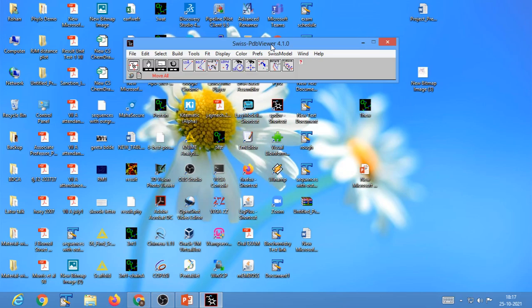Okay, so sometimes it might happen that you might change some preferences. So in order to begin from a fresh start page, I usually do these things, and I would advise you to do the same. Always set your preferences to default so that everything would work very fine. Okay, so now let us begin with our favorite molecule 1HEW.